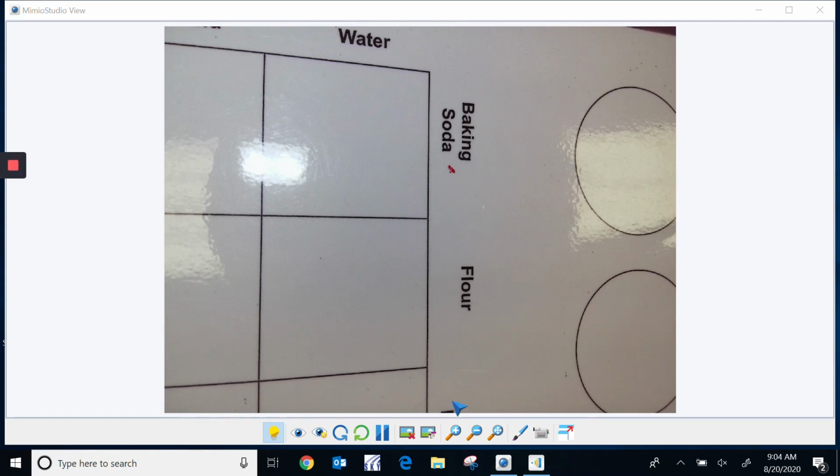Okay, we're going to be doing a mystery powder investigation, so I'm going to give you a little background information of what we are doing. Each winter, Mrs. Mary makes a batch of her sugar cookies to give to all the good boys and girls in her neighborhood. However, a bad little boy named Norris McNaughty snuck into her kitchen and mixed up all of her special baking powders. Norris left 3 large piles, each containing a different mixture of her powders.